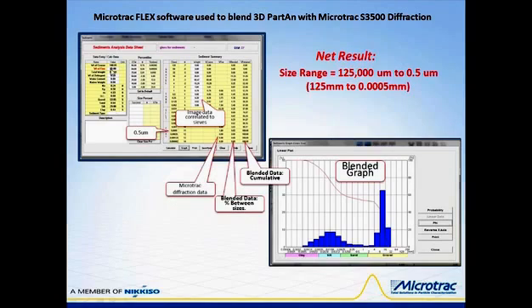The very first thing that would have to be done is we have to separate these particles into two fractions and weigh them. And this is a very simple thing. It requires only one sieve to obtain the weight of the fines. The fines in this case are going to be the Microtrac diffraction data, since that's what's measuring on the finest end of the distribution.